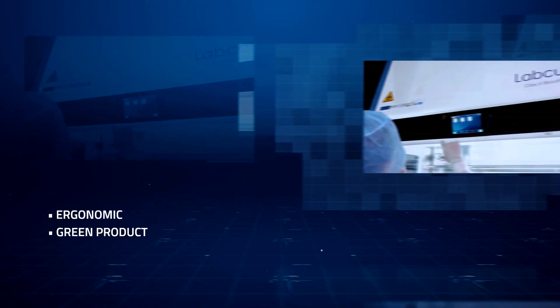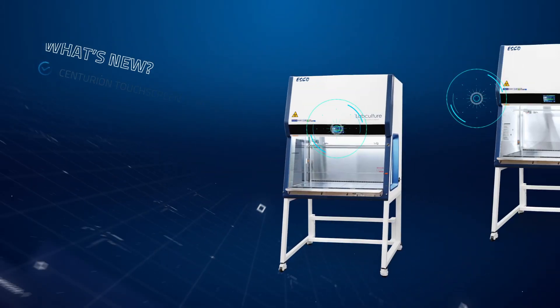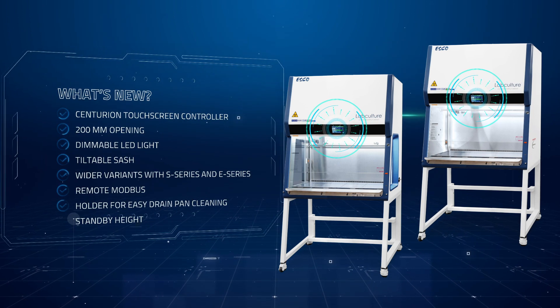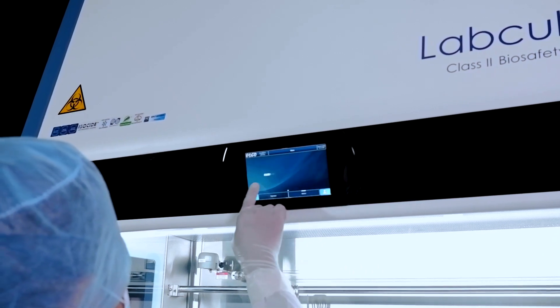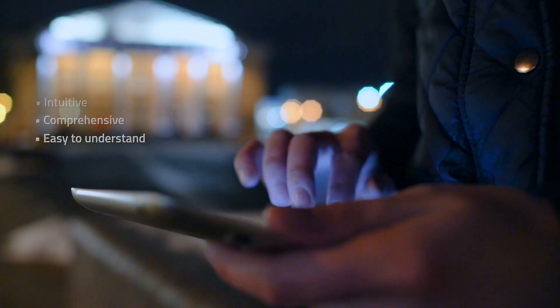Engineered with a fusion of ergonomic and green features, it seamlessly integrates supermodern technology. Introducing the all-new LabCulture Plus Biosafety Cabinet, enhanced with the ESCO Centurion Touchscreen Controller, featuring a 7-inch screen with touch functionality suitable for gloved users, intricately crafted with smartphone-like intelligence and cutting-edge technology.